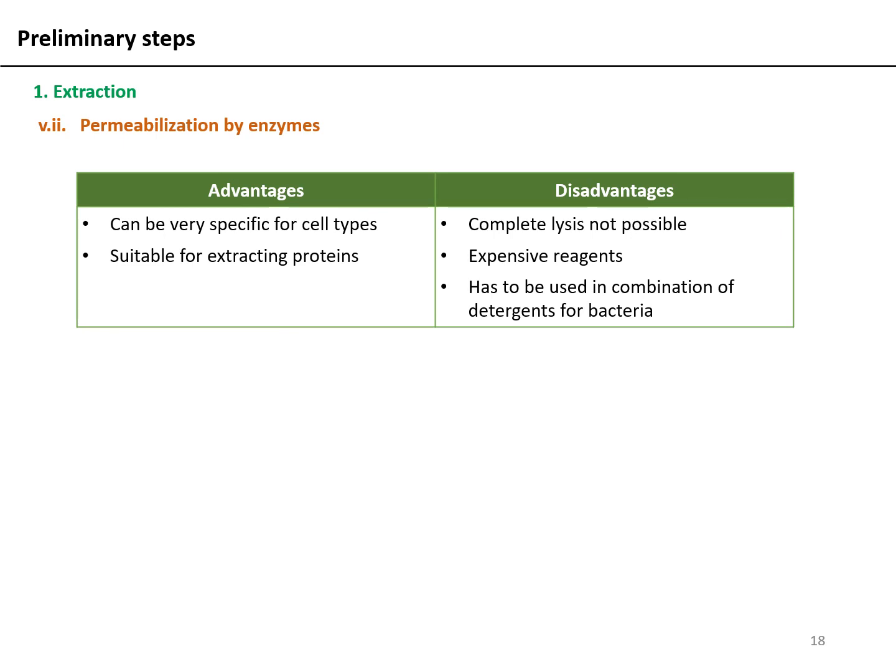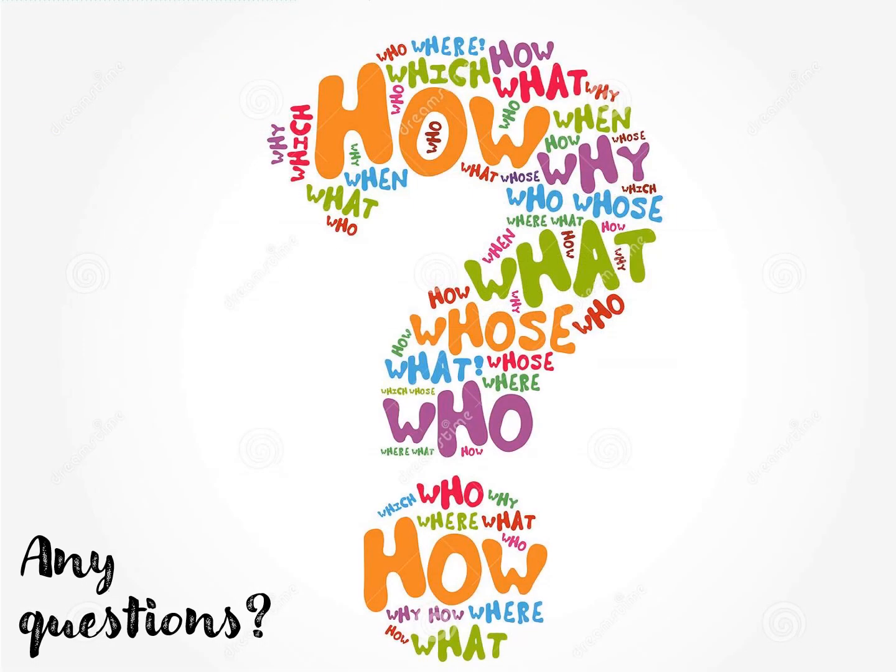We will also talk about ammonium sulfate precipitation, a method commonly used to remove unwanted proteins from your soluble fraction and leave out only your protein of interest. So it's basically a procedure for cleaning up the soluble fraction so that you have just your protein of interest with maybe a few other contaminating proteins, and a majority of them have been removed by this precipitation method. So this is all we had to discuss about cell lysis.